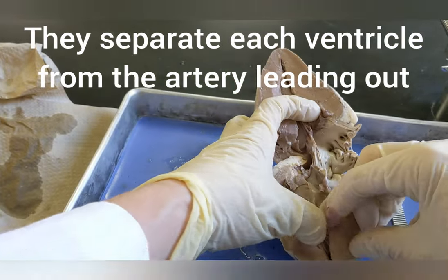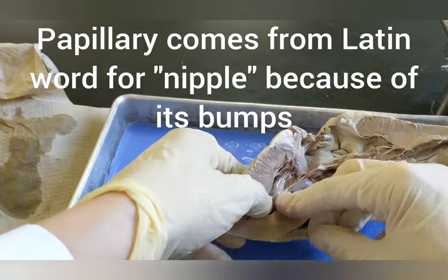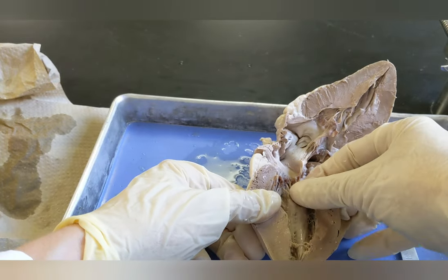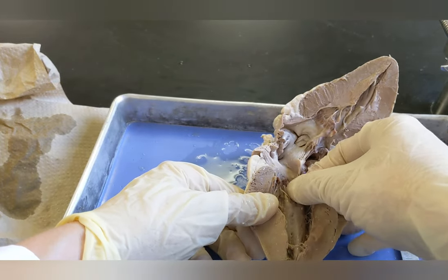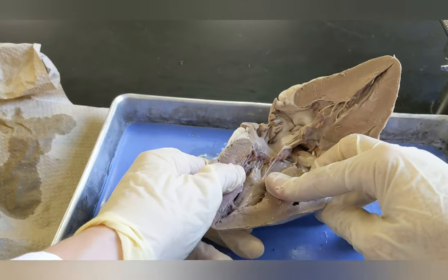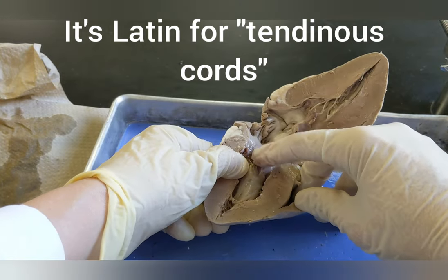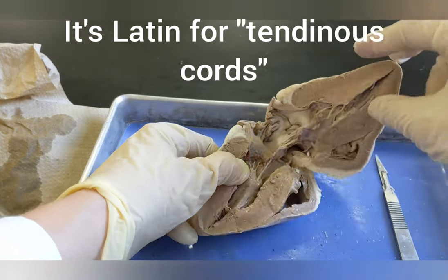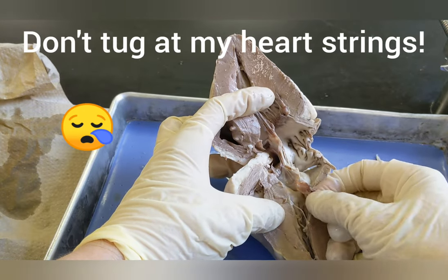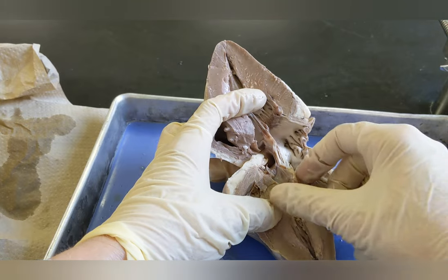The next part is the papillary muscle. The papillary muscle is what you're going to see inside the ventricles — it's kind of shiny and it has these strings. It's what tugs at the valves. These strings are called the chordae tendineae, and when someone says 'you're tugging at my heartstrings,' this is what they're referring to. The chordae tendineae are the heart strings that the papillary muscle pulls on to open and close the valves.